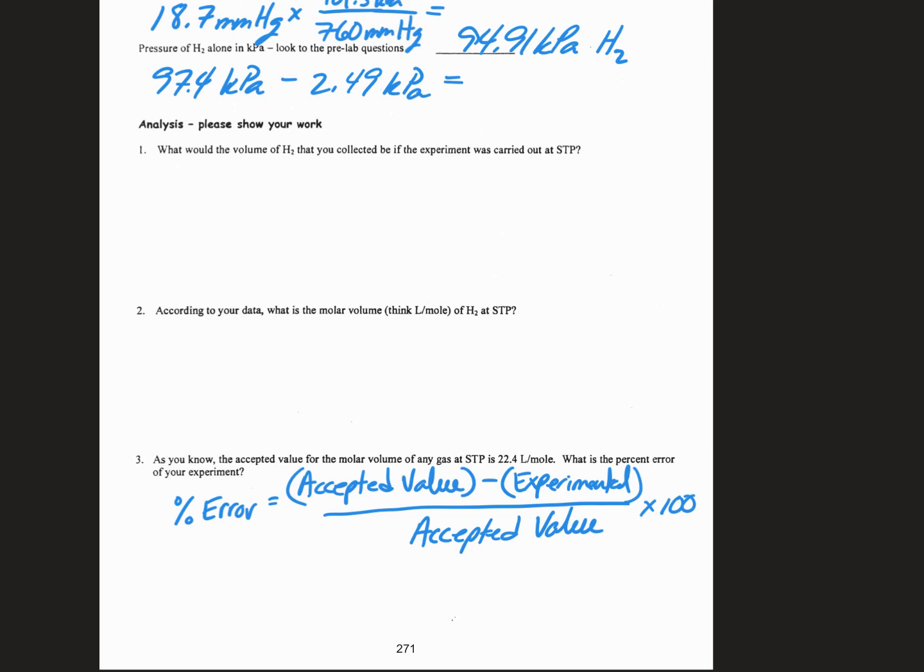I've done quite a lot here. One of the reasons I wanted to work through this with you like this is because we had never worked with Dalton's law of partial pressure. But I hope that you find that to be very simple. It should be very simple. But you can do the rest of this analysis. If you're not sure what to do there, look back to the practice problem that we did in the pre-lab.